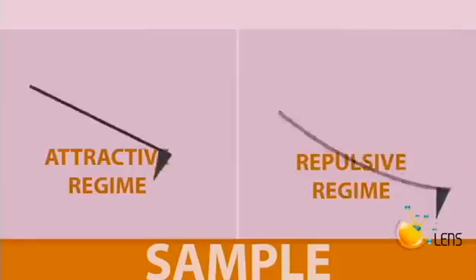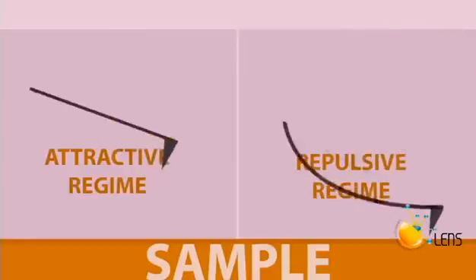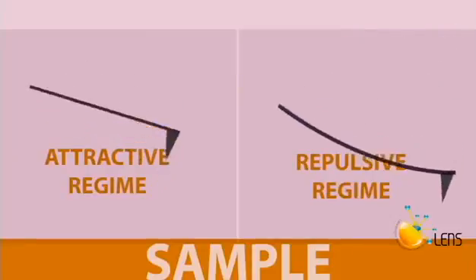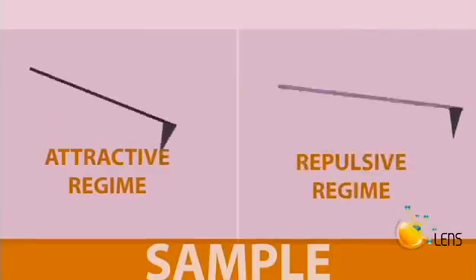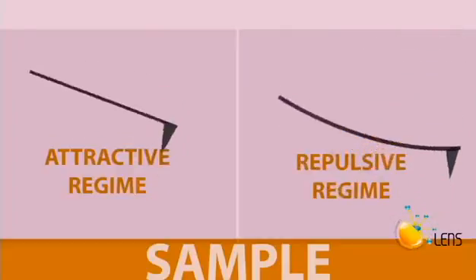In this tutorial, I will be concluding the topic on the MFP 3D AFM. Specifically, I will show you how to image in both attractive and repulsive regime. Also, I will show you how to save and export the scan images. For this demonstration, I will be scanning a calcite surface. The surface could be challenging to scan, but I will show you some tricks to get around the challenges.